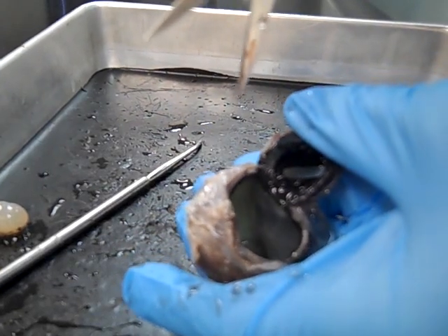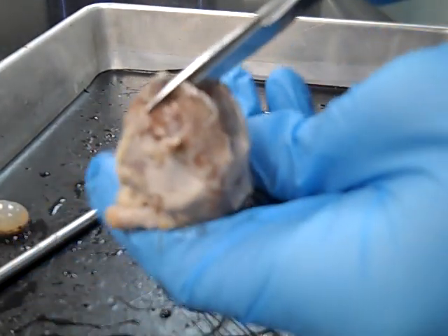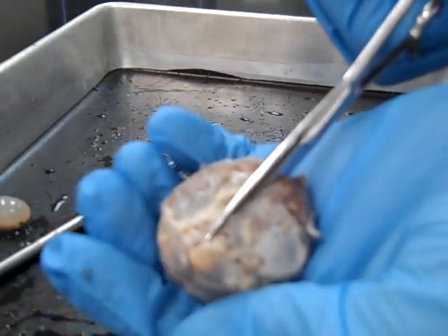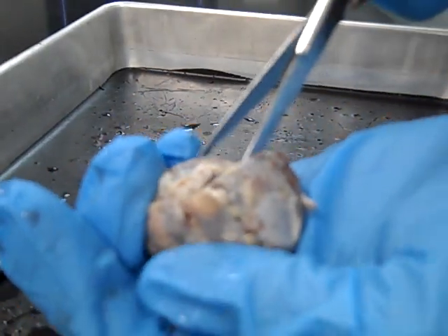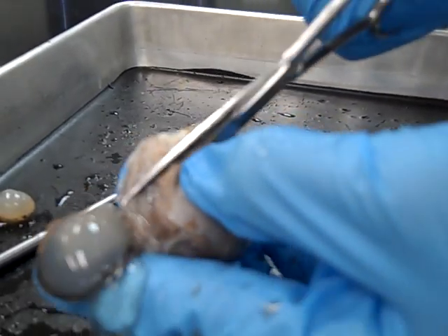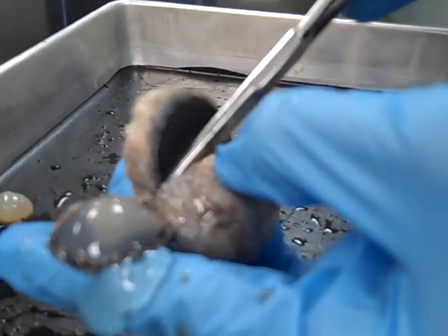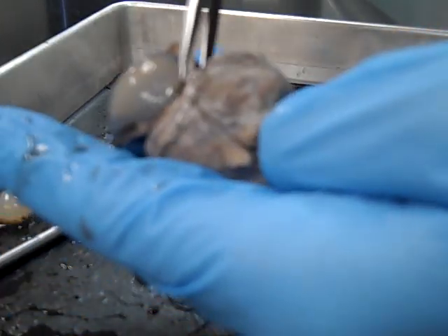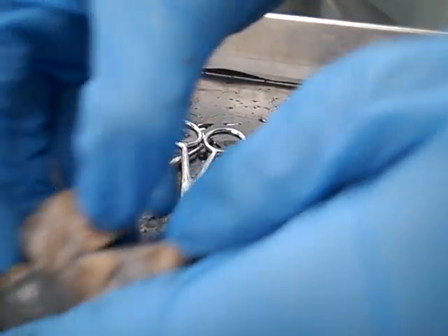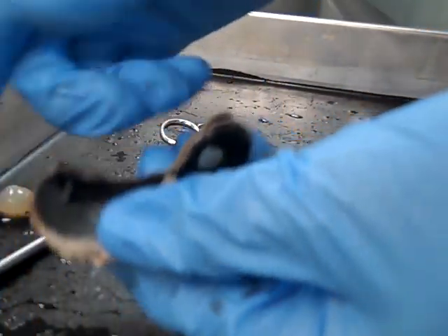We're going to split the eyeball in half at this point. You want to do this carefully — I'm going to avoid the optic nerve. Be very careful to keep your fingers out of the way. If you're doing this on your own, take your time. You do not need to do it this quickly, because I'm a trained professional.